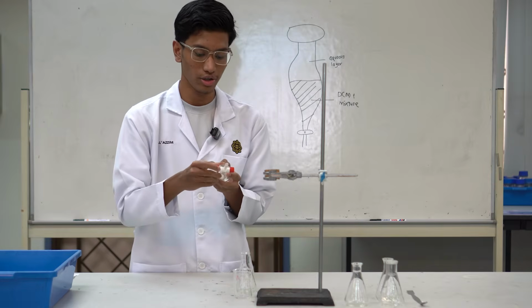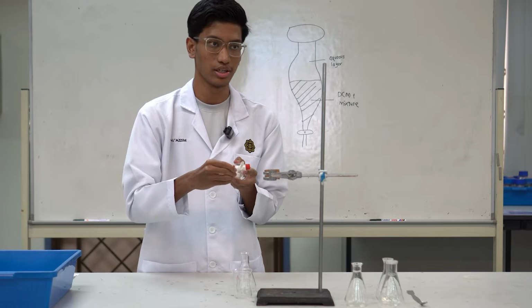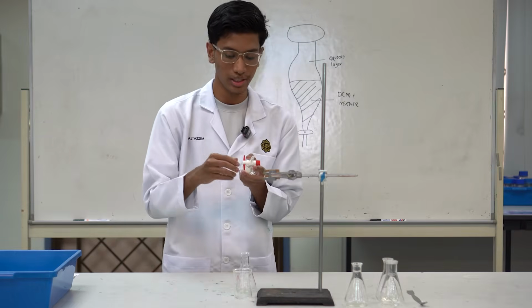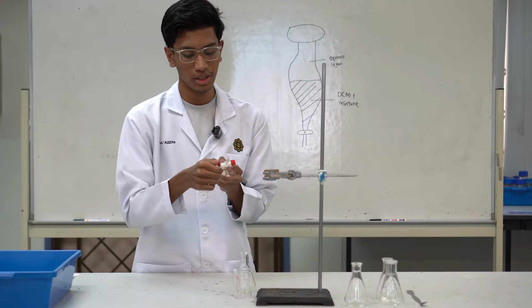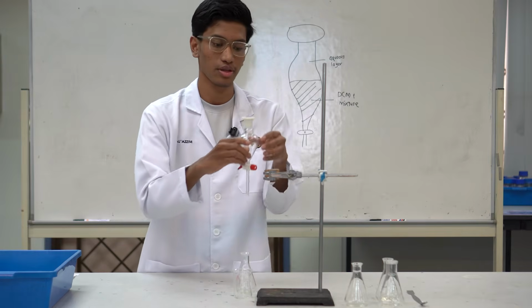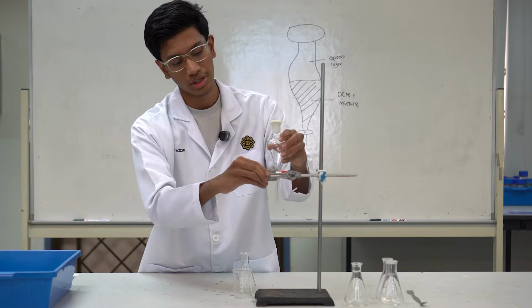The pressure occurs because the reaction happens between the mixture and the base inside the separation funnel. We must do it repeatedly to make sure that the reaction between the solution and the mixture occurs completely. Then we put the separation funnel back onto the retort stand.